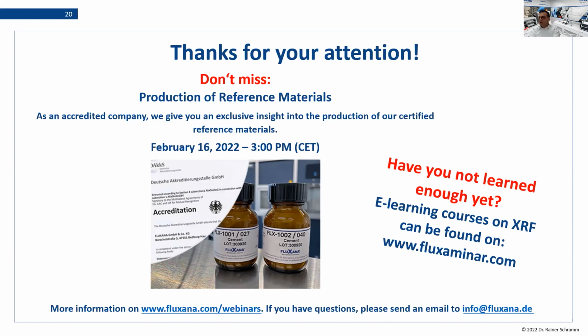I think that is a good starting point. And then you need more standards if you have a lot of inter-element effects. So if you have disturbing elements, which make your lines curved, then for every one of these disturbances, you need an additional standard sample which represents this effect. Yeah, so it's 5 plus.